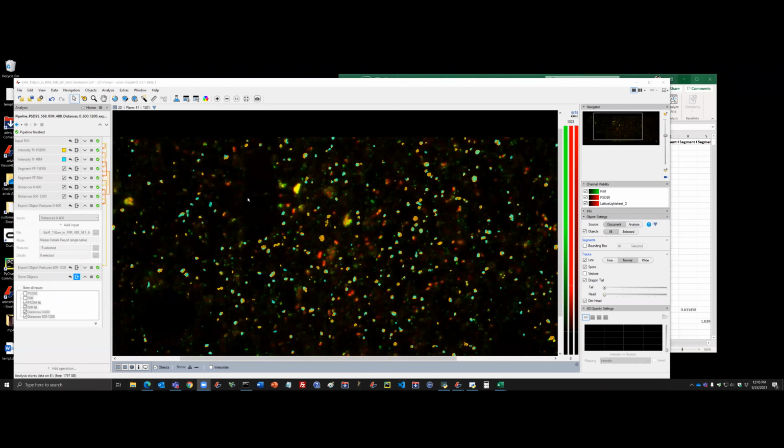So you mentioned, or Molly did in the intro, having machine learning algorithms, and you must have a bunch of other filtering processes, etc. What can you do within the software to be smarter about identifying the objects in the very first step? Or is the solution using Elastic or something to train outside and then bringing in a probability mask into your software?